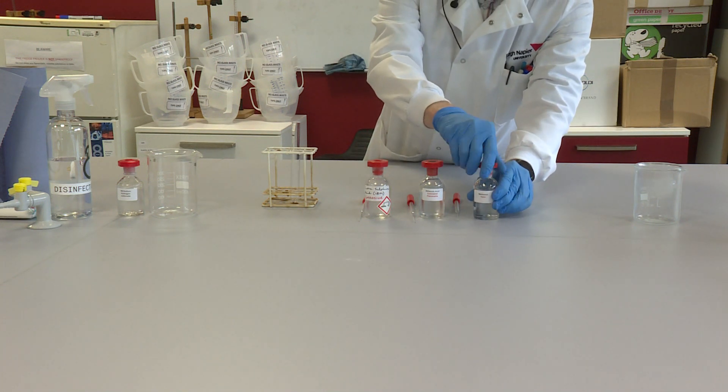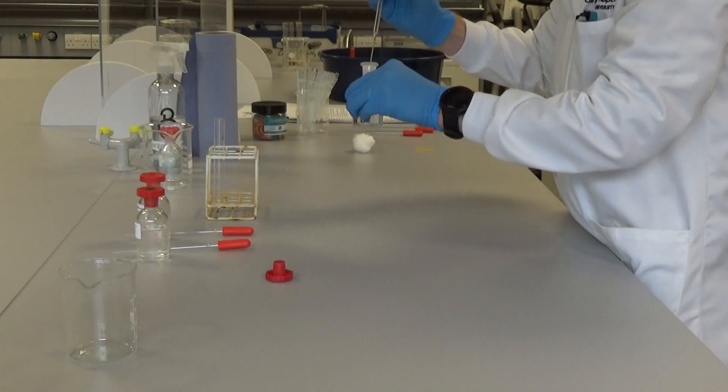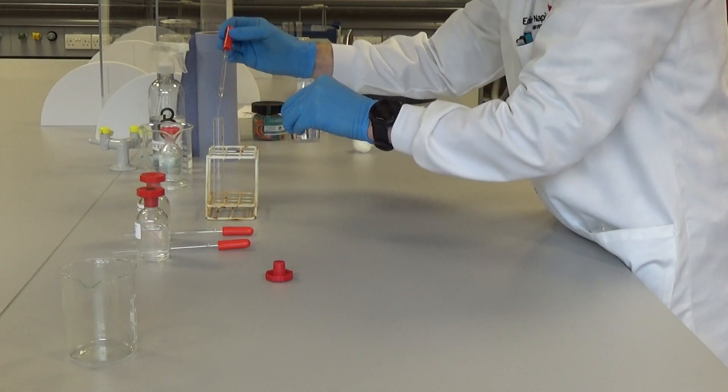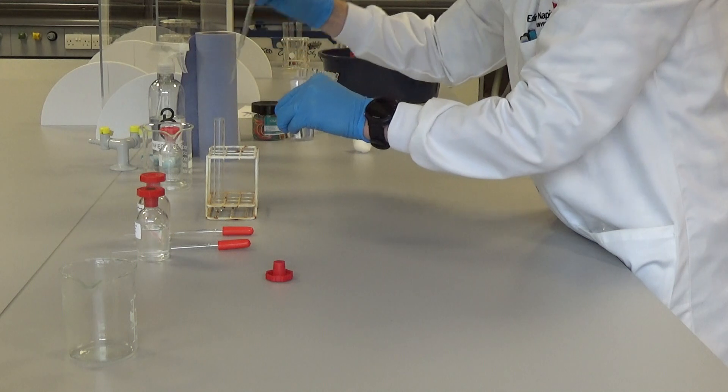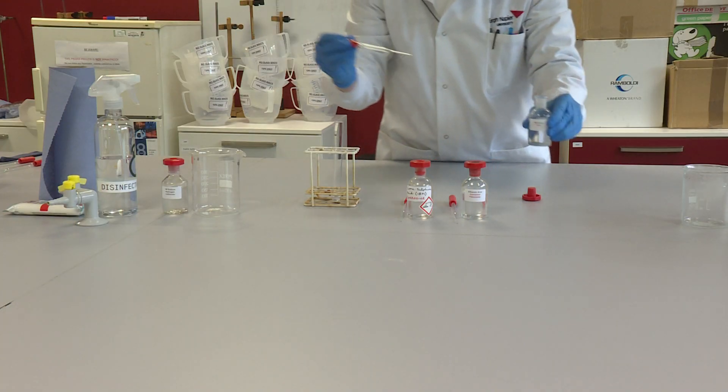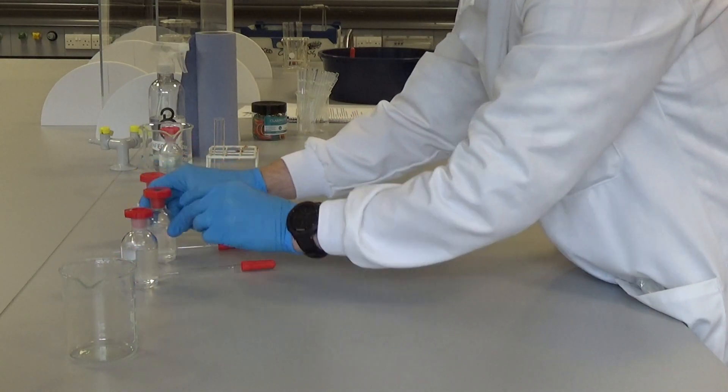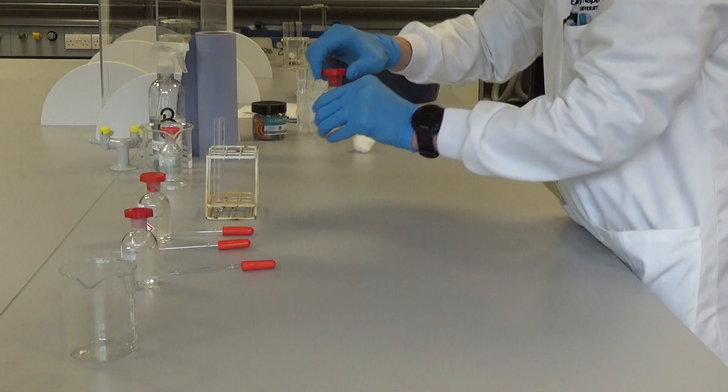I'm going to start by adding some of the alcohol, the methanol, to a test tube, approximately a depth of about one centimeter. Then I'm going to add approximately the same volume of the carboxylic acid, the ethanoic acid.